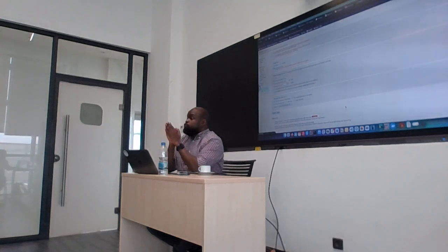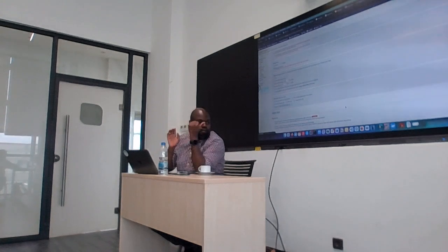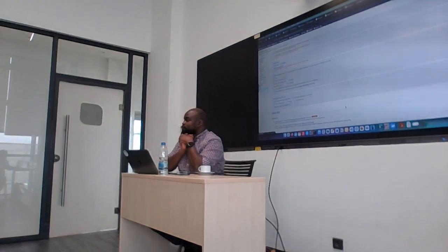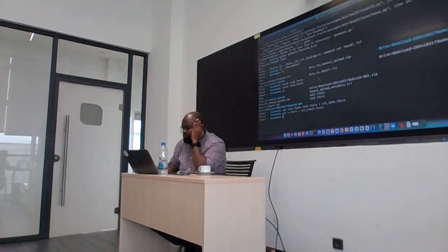However, we want to use the MAFFT that is available on the command line. So we want to install MAFFT using Conda. This is simple. So can you install MAFFT in your environments, which you should have received on Slack and WhatsApp? I think it should be conda install, bioconda.